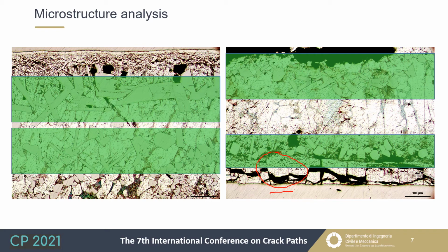Then we have the presence of a three-phase part, where we can see a globular white phase, a lamellar phase around the white phase, and the presence of regular phases like this or like this, dispersed in longitudinal zones of the section of the coating, characterized by high values of titanium.